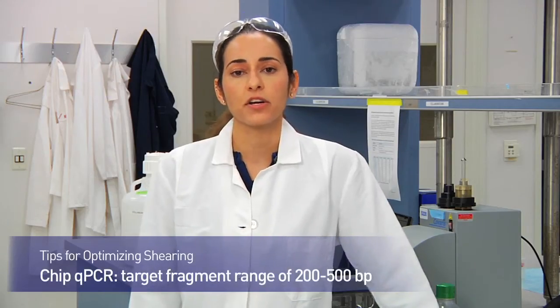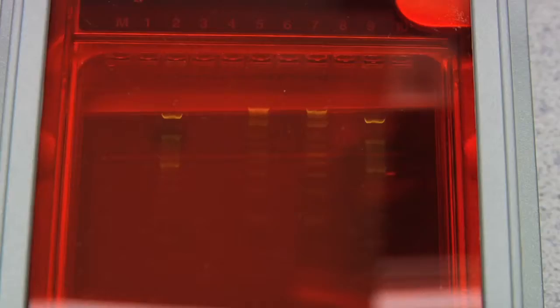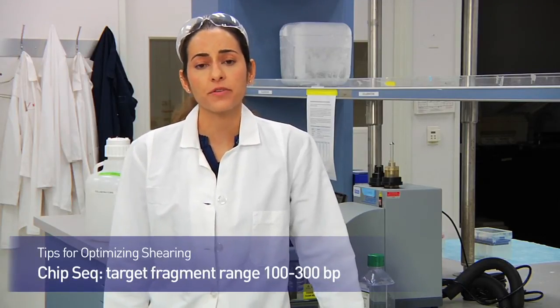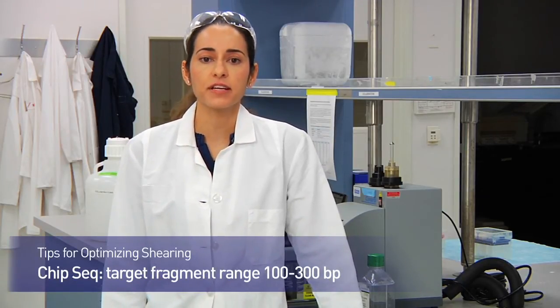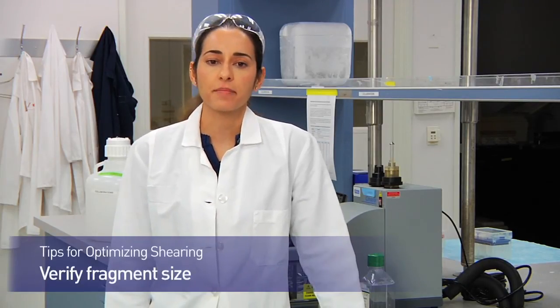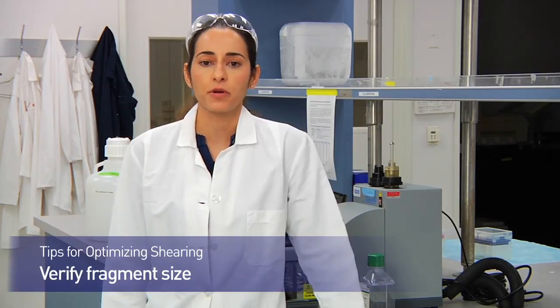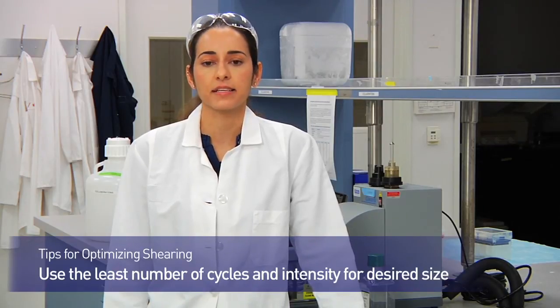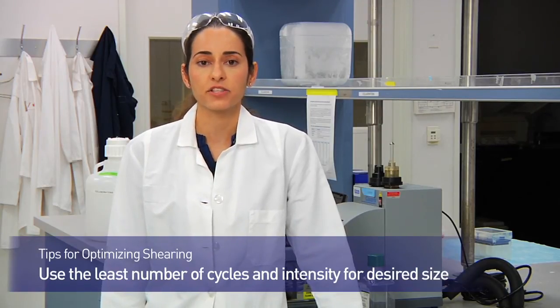For ChIP-qPCR, shoot for a fragment size between 200 to 500 base pairs. If you're using another platform, follow that vendor's recommendations. Be sure to verify your fragment size before moving into your immunoprecipitation step. You want to aim for the least amount of sonication cycles and intensity that gives you the correct size distribution.